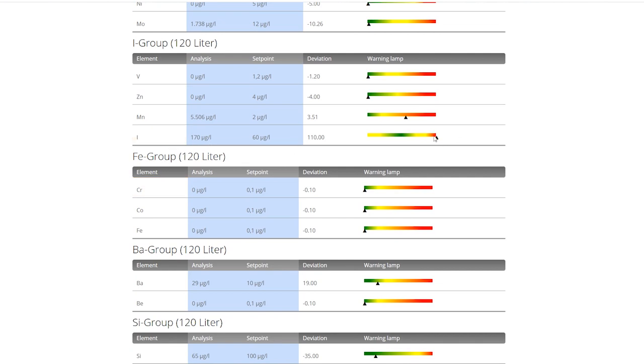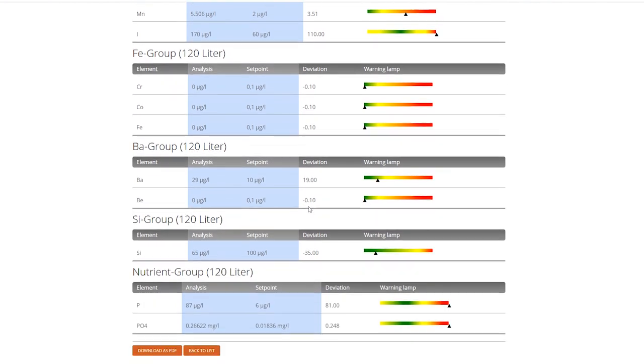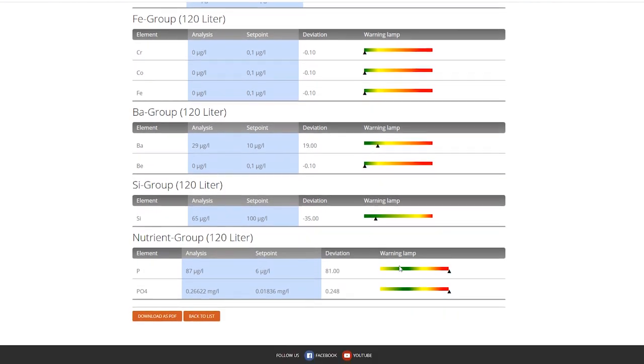And iodine is pretty far off, so there is something totally wrong with that. So this is a big indicator, the iodine. So I need to find out why it's so high. All the rest seem to be fine.